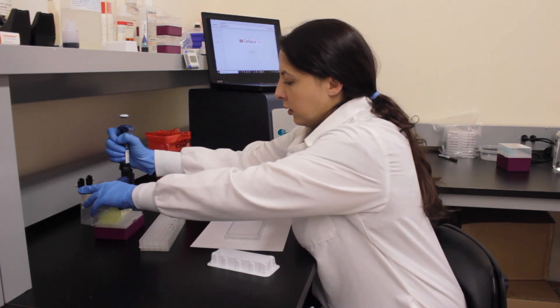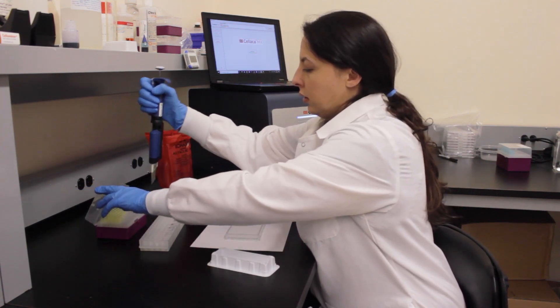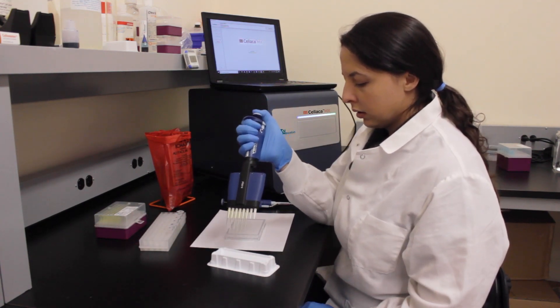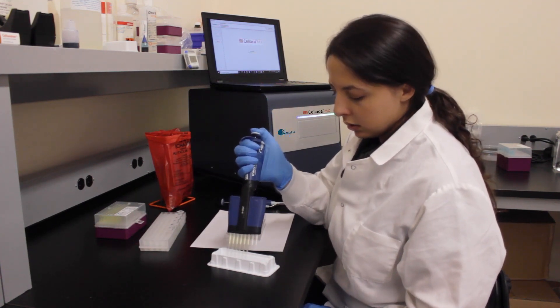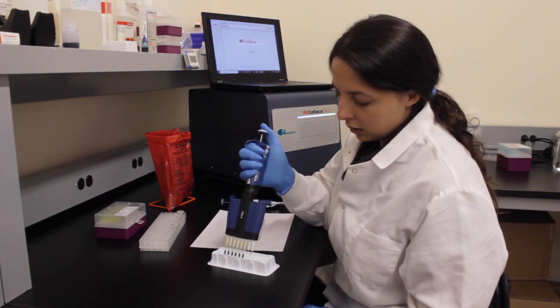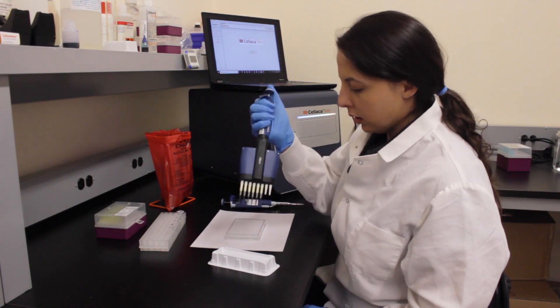For this experiment, CHO cells will be stained with Trypan Blue at 0.2% and imaged within the same Cellaca MX consumable.